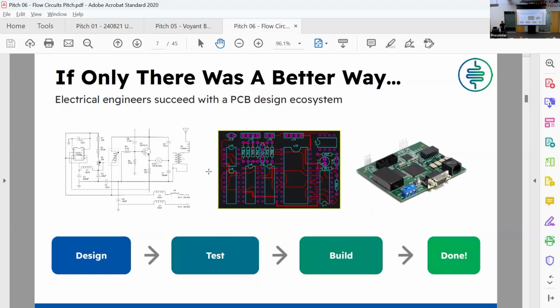And so I asked when I was doing this work, what if there was a better way to design microfluidics? We can look at the electrical engineers. How do they build circuit boards? We're building circuit boards just with biological fluids for automating labs. So I looked at what they did. They can design detailed, complex PCBs and schematics. They can simulate performance with all the voltages and currents. They can translate that to a PCB, and they can hit go and fabricate that part in 2 weeks.